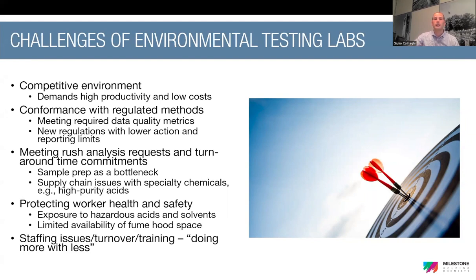First of all, it's a very competitive market, where high productivity and the cost of analysis are pivotal for the profitability of the lab. It is also very regulated, so there are specific metrics to address, and they have to be open and quick to adopt a new regulation with lower action and reporting limits. Also, the laboratories have to deal with rush samples and fixed turnaround times due to commitments in some contracts.